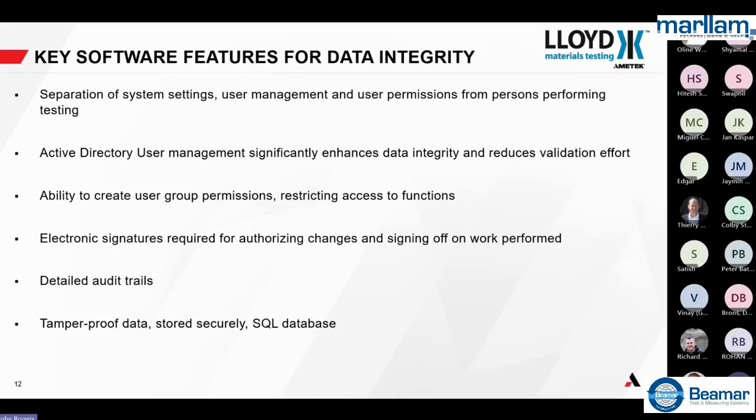It also reduces a lot of the validation effort, because a third of the 21 CFR Part 11 is ensuring things such as the length and complexity of passwords, how often users need to change them. Since we are piggybacking off the Active Directory, obviously your corporate system will be compliant anyway, so there's no need to then validate that aspect of 21 CFR Part 11.